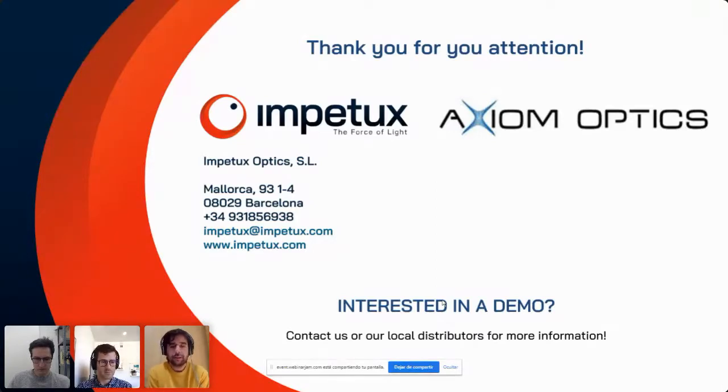Yeah. Generally, the fact that we typically use glass slides is just for convenience. The only requirement is that the lens of the sensor must be in contact with the sample. So there must be space for the lens to get in contact with the sample. If you use petri dishes which are too small, then the lens won't fit there, and that's not valid. But if you use larger petri dishes, then it's fine. It's just a geometry thing, okay? You can use glass slides, petri dishes, or other microfluidic chambers. There's no restriction on that. Yeah. So just to make it clear, we are talking about the force measurement sensor, which is coming from the top and needs to be in contact with the sample. So that puts some restrictions on the geometry of the chamber.